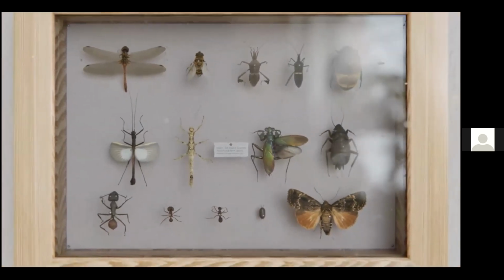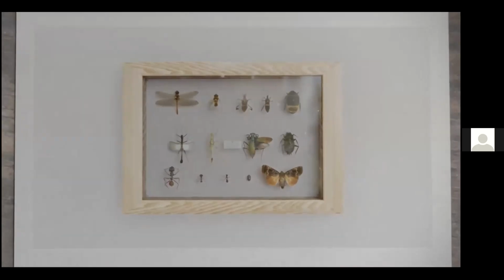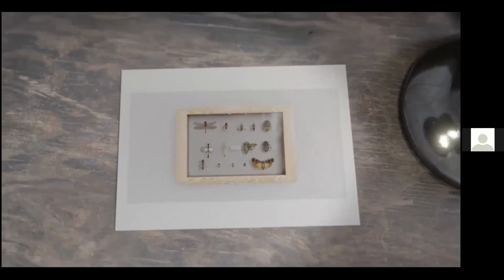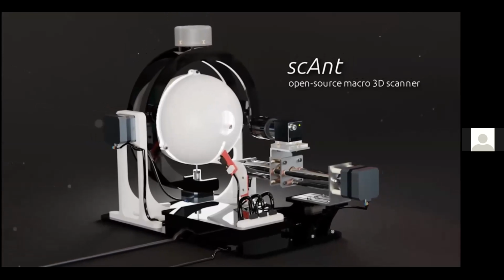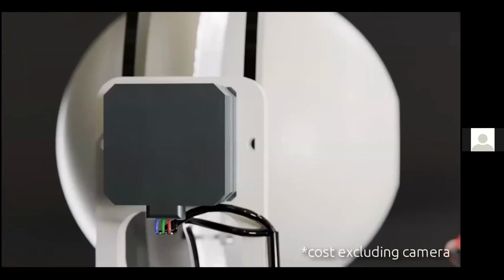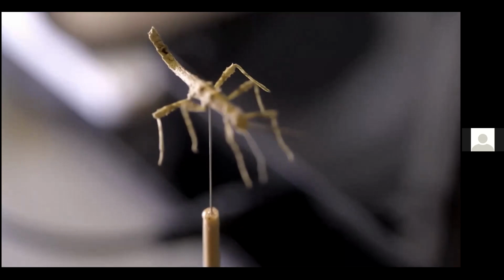Yes. Okay, cool. Just to confirm, there are large natural history collections. Plenty of these mean that if you want to access the specimen, you have to go there. If you go there, you have to take out the specimen physically. That comes as risk to damage them. And people take images, but these are 2D. And to overcome this problem and provide 3D images, we've developed a system that we call scAnt that can help people to make 3D models.